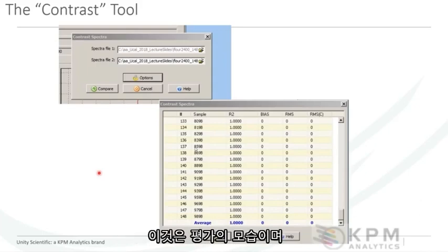This is what the evaluation looks like. It puts things out in a noise perspective and from a bias perspective. You will not get a perfect correlation, but it should be close. And there are recommendations of what the limits should be in the help file.